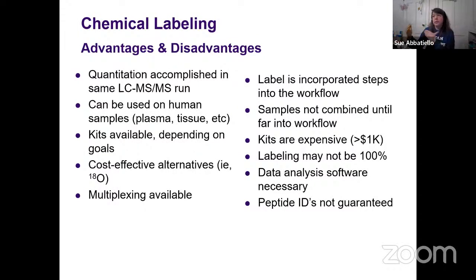And the idea here is you are able to detect less abundant species. And so you're improving your dynamic range of peptides that can be detected from your sample. The problem is reproducibility of that fractionation and quantifying some of the signal if it's been split into a couple different fractions. And so it depends on your experimental goals.